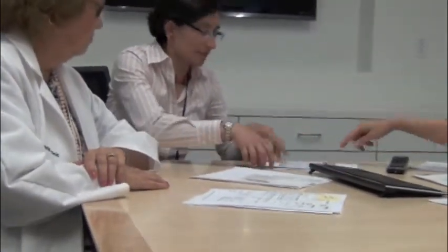What does blasting mean? It's in the GenBank database. Oh, okay. It's online. Yes, that's online for GenBank. And GenBank has all these, it's a database of all the sequences for all these different types of mycobacteria species, as well as all kinds of Nocardia bacteria species, and the human genome and all kinds of other bacteria. So they have a blank that you put your 30 base pair nucleotide sequence in, and then it will go through its database and find a match. So you would enter what you got from the pyrosequencing.